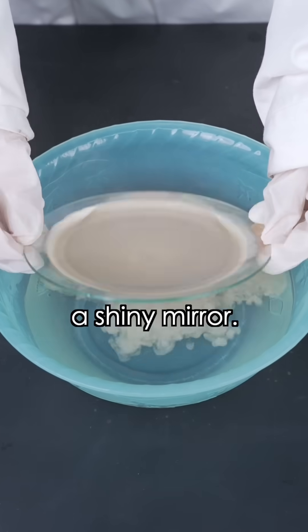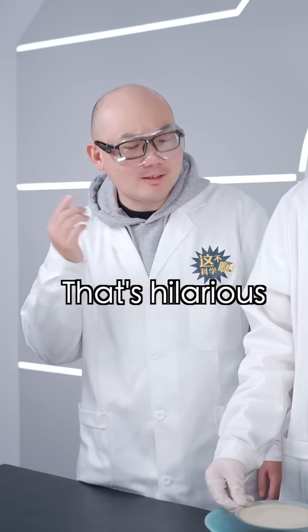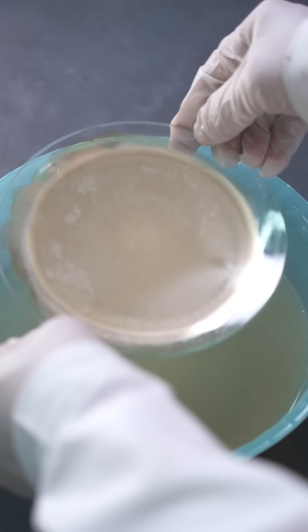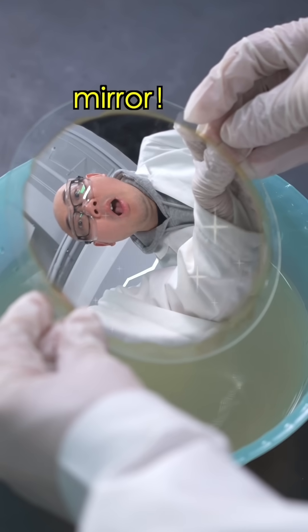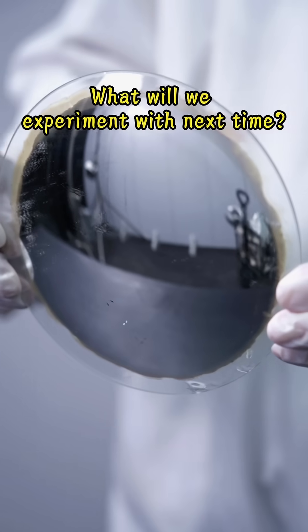The result is a shiny mirror. What? Where's the mirror? Ha ha ha, that's hilarious. Wait, there's a twist. Twist? What will we experiment with next time?